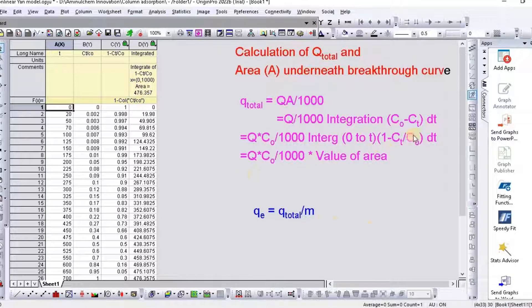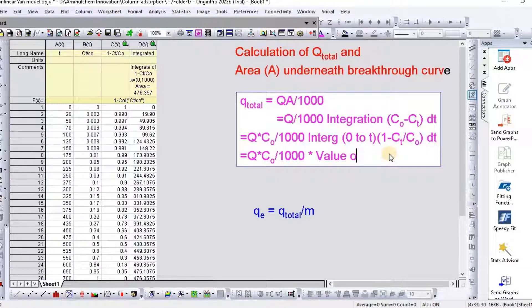So here you can write the value of area is 476.357.